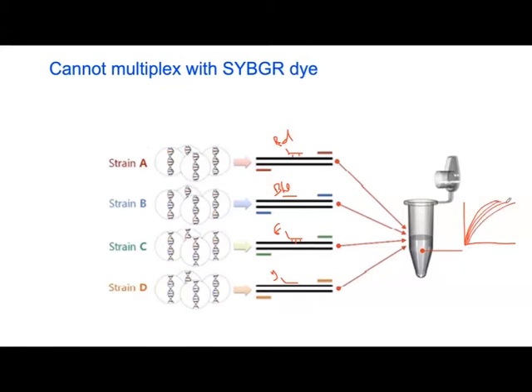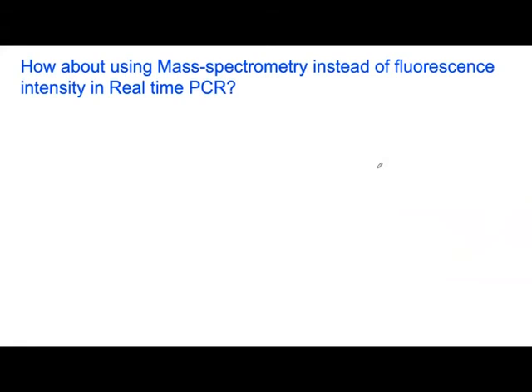And this is actually what you do in coronavirus. In coronavirus, usually we have multiple genes. We don't measure one gene, and to call a sample positive, we try to mix 2 colors in one well. This will save time and also save money. Instead of running each strain in 4 tubes, I can run them in 1 tube and get the answer in one single reaction, one single day, immediately. So that's basically what multiplexing means.